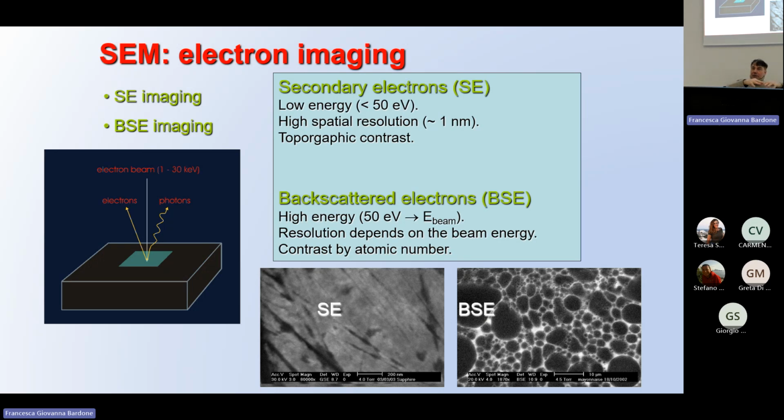An image of the surface. The best image of the surface I could have. I need to select these very low energy electrons. When you work with the scanning electron microscope, you can select this type of detector, called the secondary electron detector. And now you know why you select this one: because you want to observe the surface. They come only from the surface.